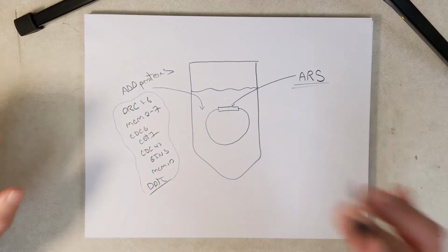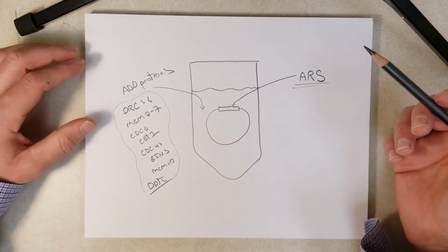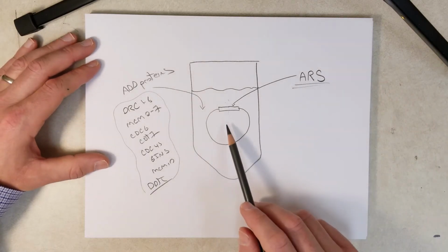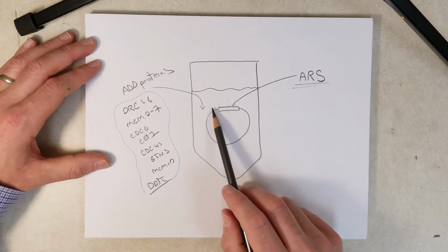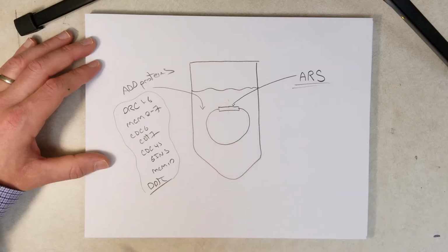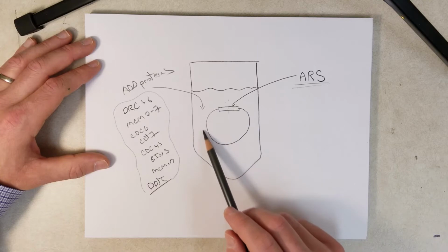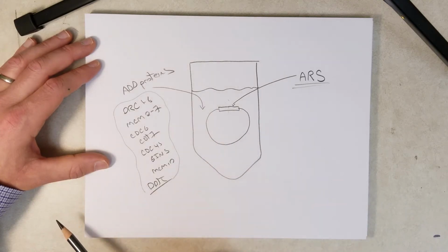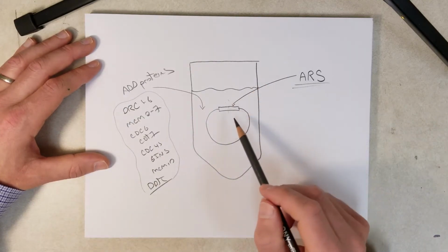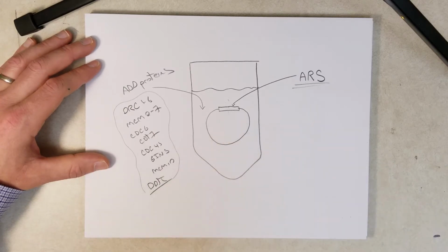So after we added all of these, you have to make sure you add them in the right order to get the initiation complexes assembled correctly. Then hopefully, if we know everything, we'll get this DNA molecule replicated. And then we can do things like measure the rate at how quickly this is replicated and see if it matches the in vivo, or our estimates of in vivo replication.